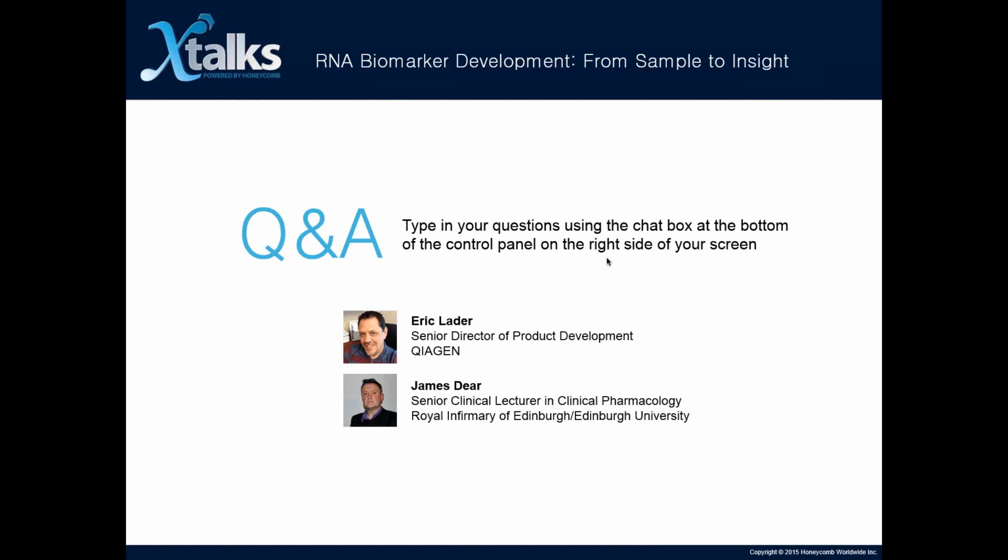And Eric, what are your thoughts on normalization? It's something that people have been thinking about for 30 years. When we've been doing screening and whole transcriptome-like sequencing, normalizing against, for example, total reads in NGS, or in PCR against the mean of the expressed sequences in a larger screen, works really well, and it's what's typically recommended in the MIQE guidelines for RNA and for microRNA.